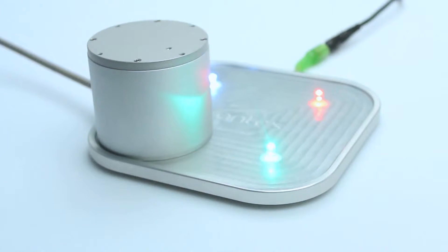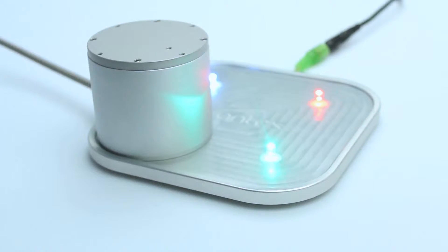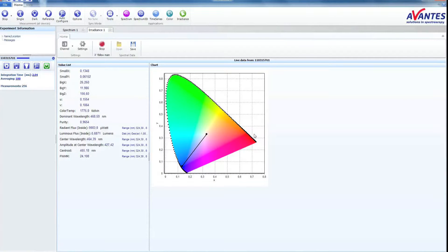Make sure you are using the correct integration time. This can be done automatically by using the Auto Configure button. If you change the integration time, a new dark reference is recommended.